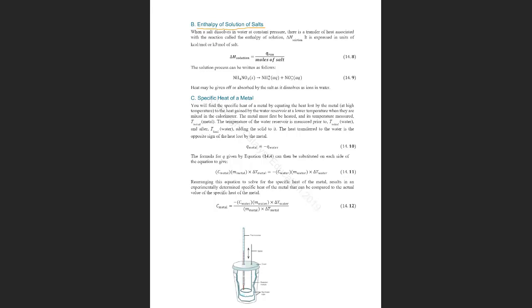So that's what we are going to calculate. First, we have to calculate the Q, the same way we did before, with the same formula, Q equals M C delta T. But the mass that you are going to include is the whole mass of the solution. So you have to include, we'll go over that, the mass of the salt plus the mass of the solution.